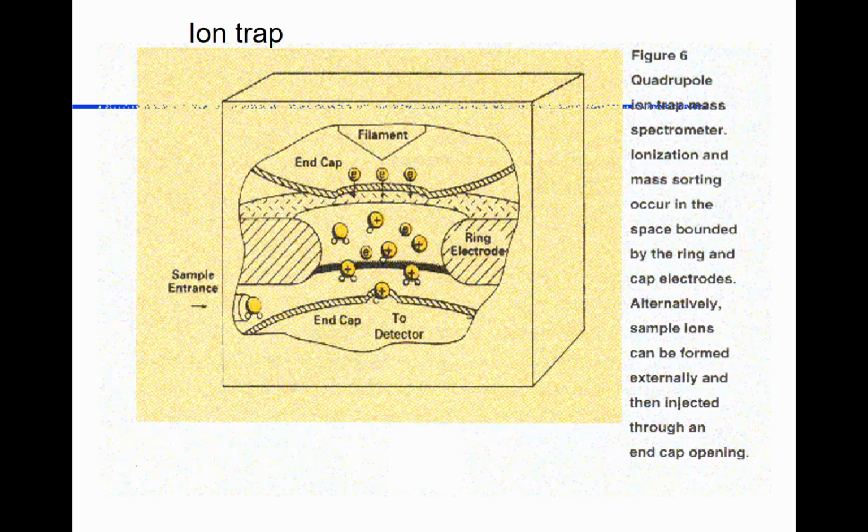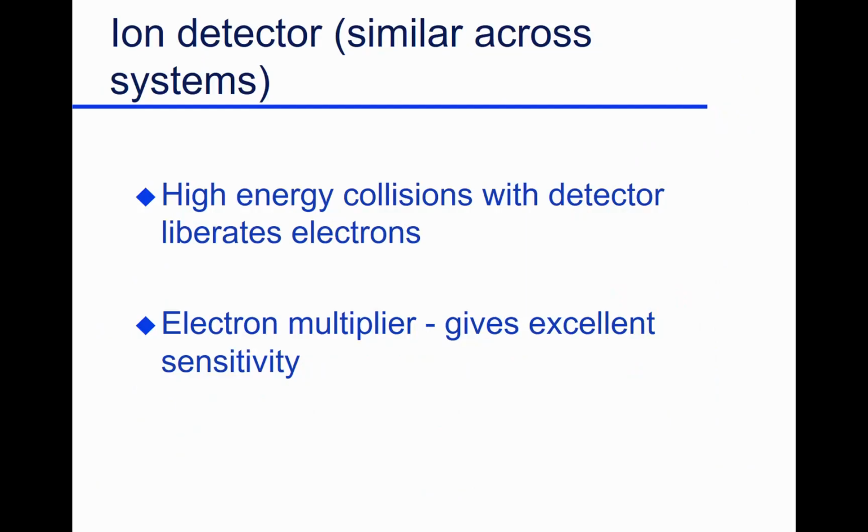So this is kind of neat, because the other instruments do it in real time: it's coming in, I've measured it, that's what I got. This one, it's coming in, we're going to concentrate, now I'm going to measure it. So it has really good sensitivity. They each are unique, they all offer certain pros and cons. The time of flight, very flexible. The quadrupole, again, very flexible, very reliable systems. And so that's what we see most of.